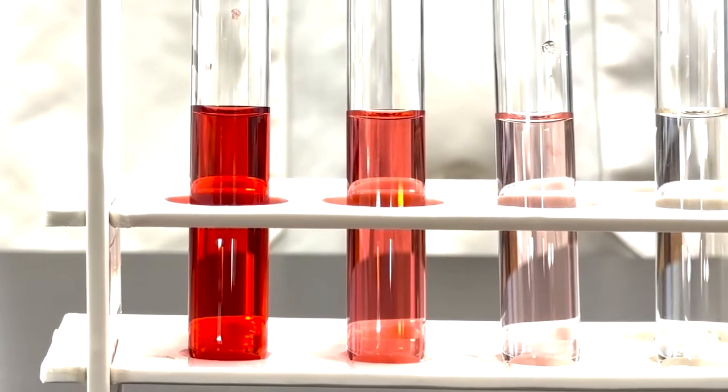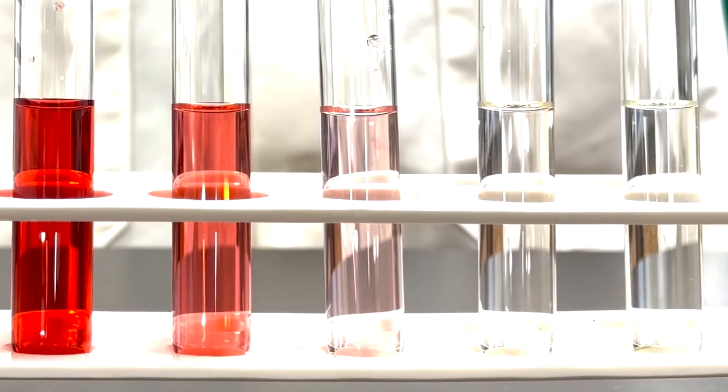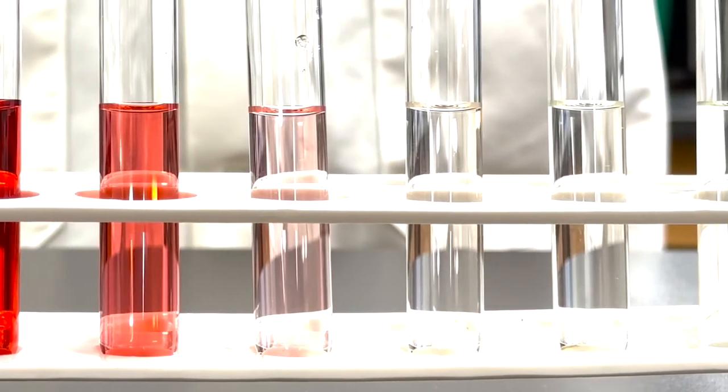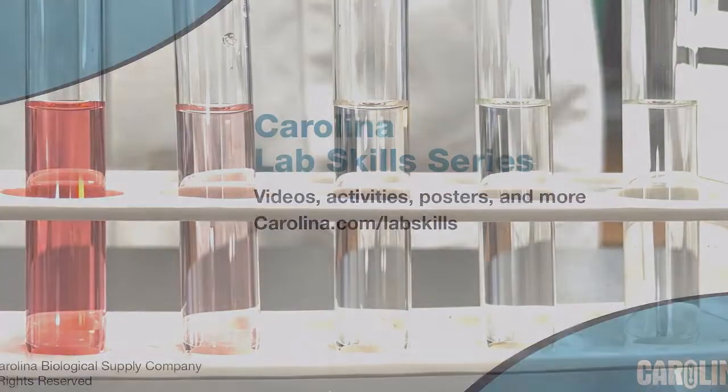Using serial dilution, you are able to employ this technique in various scientific disciplines to enable precise concentration adjustments, prepare standard curves for accurate quantification, and create diverse experimental conditions.